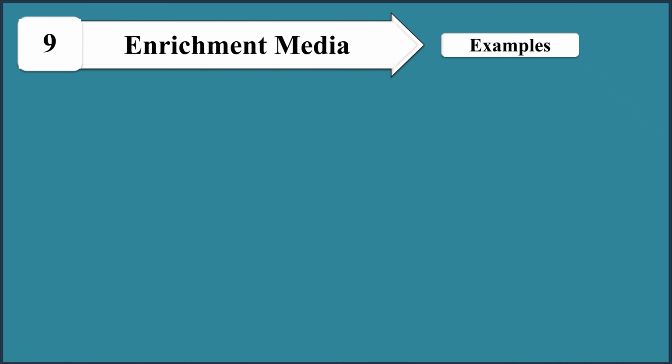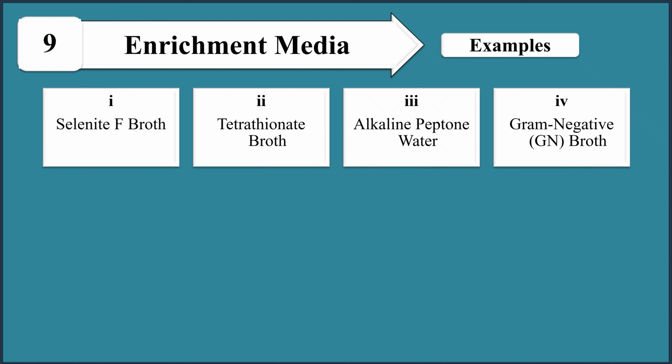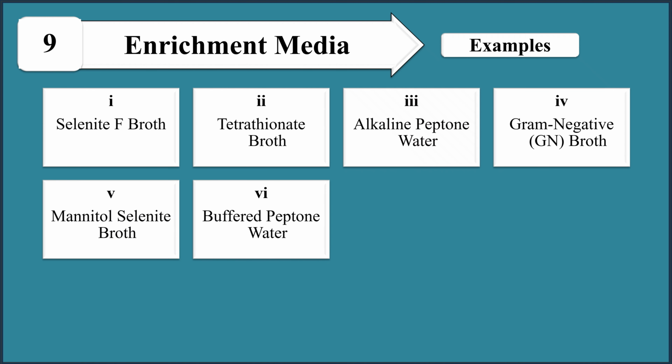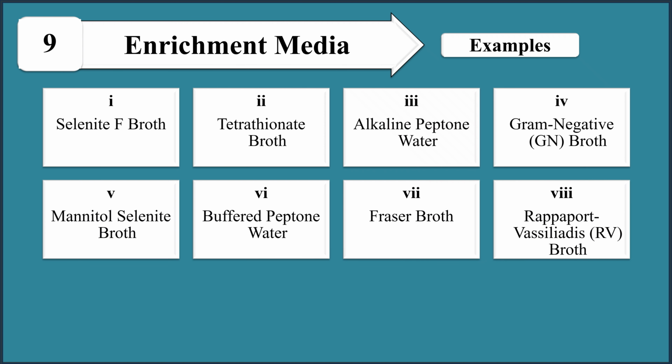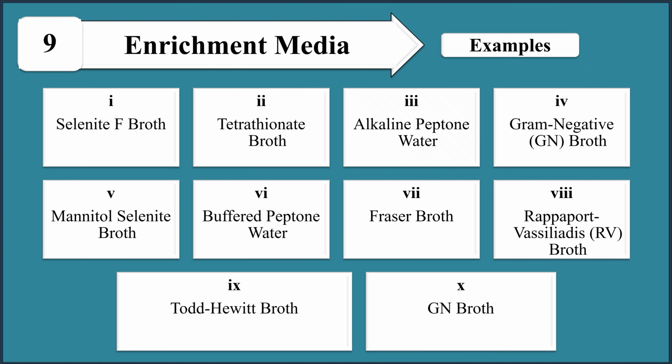Examples of the media that are used as enrichment media: selenite F broth, tetrathionate broth, alkaline peptone water, gram-negative broth, mannitol selenite broth, buffered peptone water, Fraser broth, Rappaport-Vassiliadis broth, Todd-Hewitt broth, and GN broth.